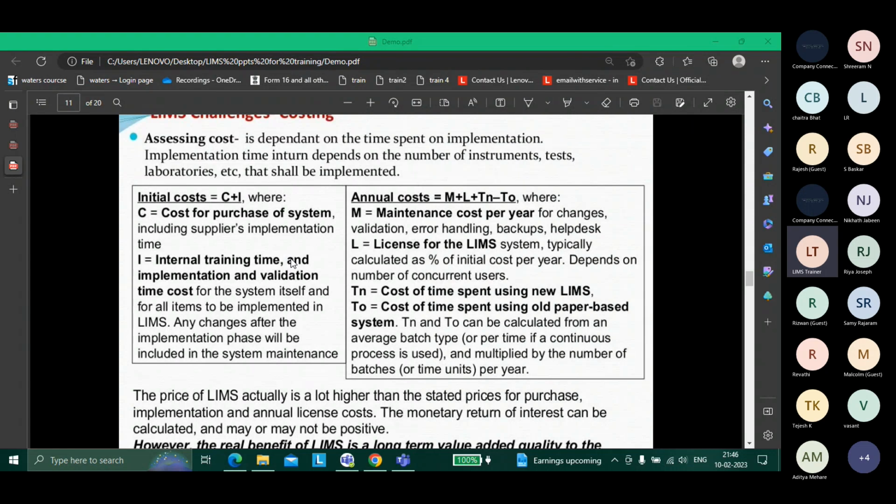You're talking about a static data migration project, I think, something related to static data. That is a very big topic: analysis mapping. If I want, I can go deep. I worked on analysis mapping, but it will take time, and I don't think that will be a part of this session.